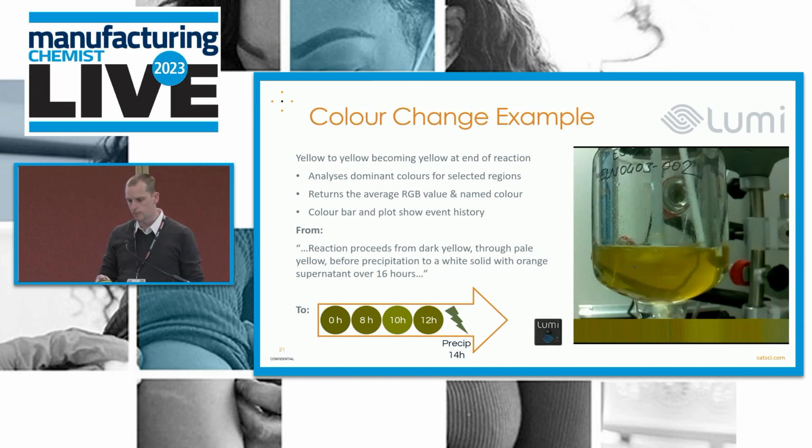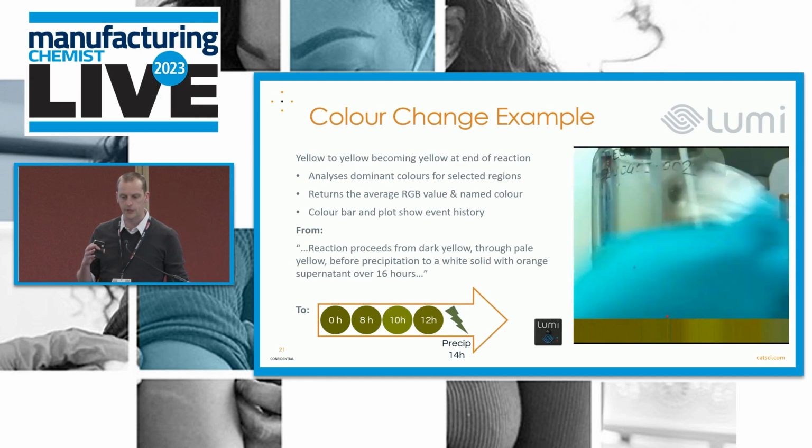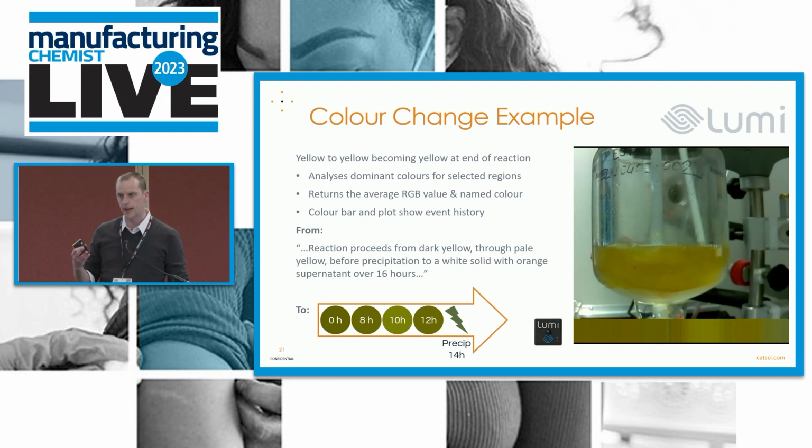Okay, we've got some, they're working, it's good. So this is an example of a reaction, and you'll watch for a long time, and it will change from one shade of yellow to another shade of yellow, back to a different shade of yellow. And so at one level, there's nothing interesting in terms of what's happening in terms of the colors here. But with the computer vision, you can start to extract the changes in shade, and you can start to plot that information. You can also start to communicate with clients exactly what happened.